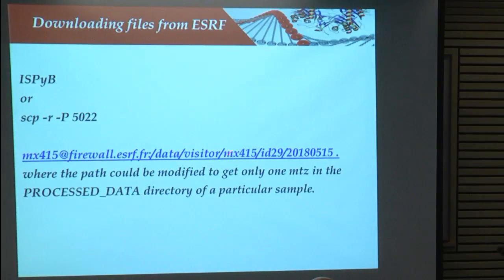When we want to download files from the ESRF, again, the PDB and the MTZ files, we can use either the SFTP or SCP command. Again, you have all the information here. For the MTZ, when you go back home, you can also download all the frames and everything. As you understood, at ESRF the frames will be there for a long time.